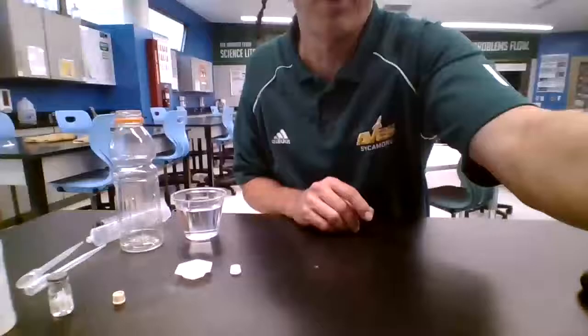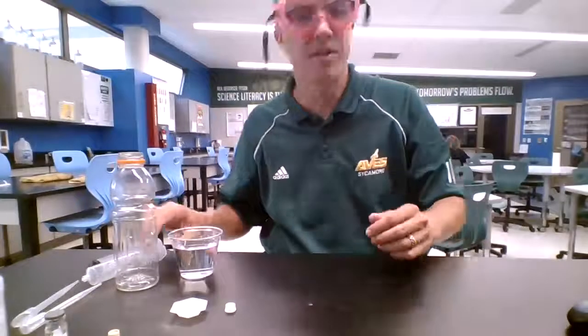And my name is Chad Husing, and today we're going to show you something that was developed by Bruce Matson to get you some gases on a microscale. This is really cool. So here's the first step that you'll need to do.